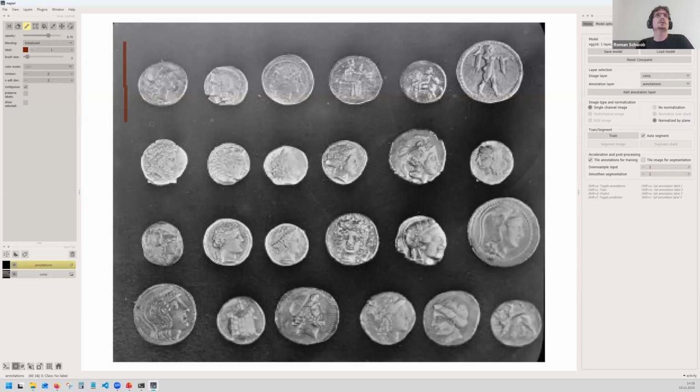We can, for example, give some information about the background at different places with different brightness. And then, as I said, it's usually good to also have some more in the other direction. So not only along the center ridge, but also like this. Let's just give it plenty of information. And then maybe also along boundaries, maybe also down here.